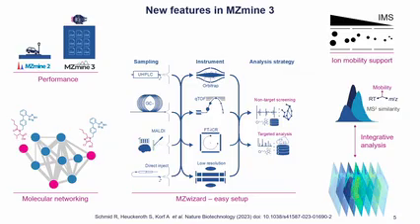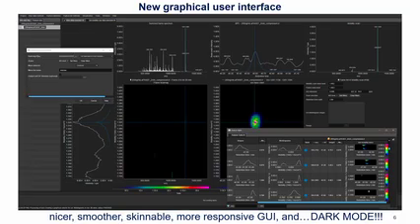We now have this nice graphical wizard where you essentially set a couple of main values, like what is the type of your mass spec, what is the type of your chromatography, and so on. And then it generates a batch of processing steps for you, and you can just click and everything is done automatically. It's very nice.